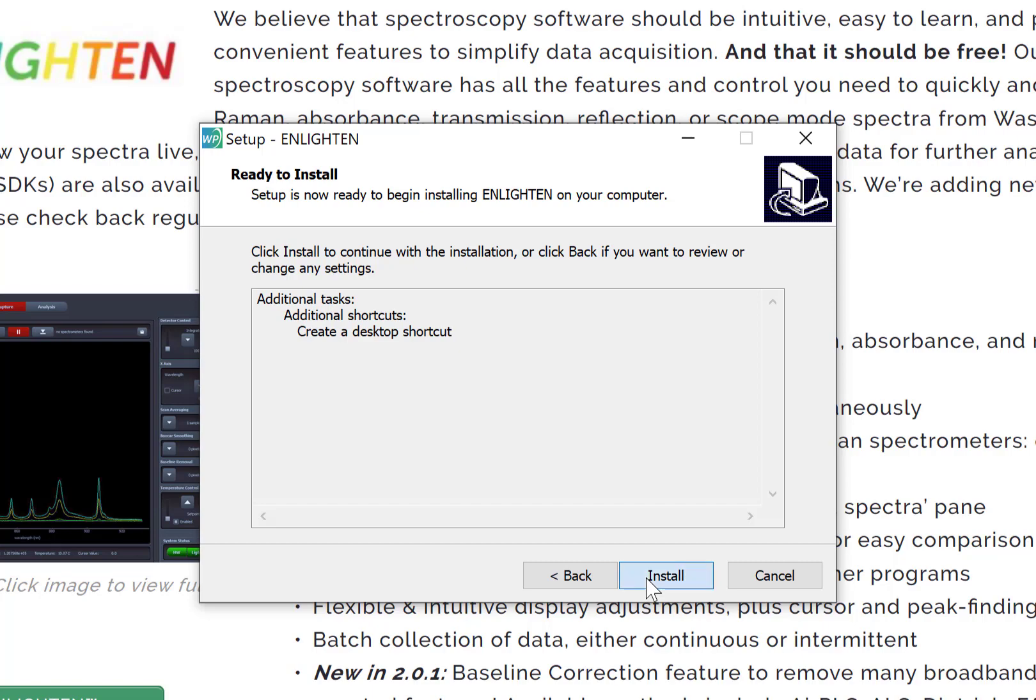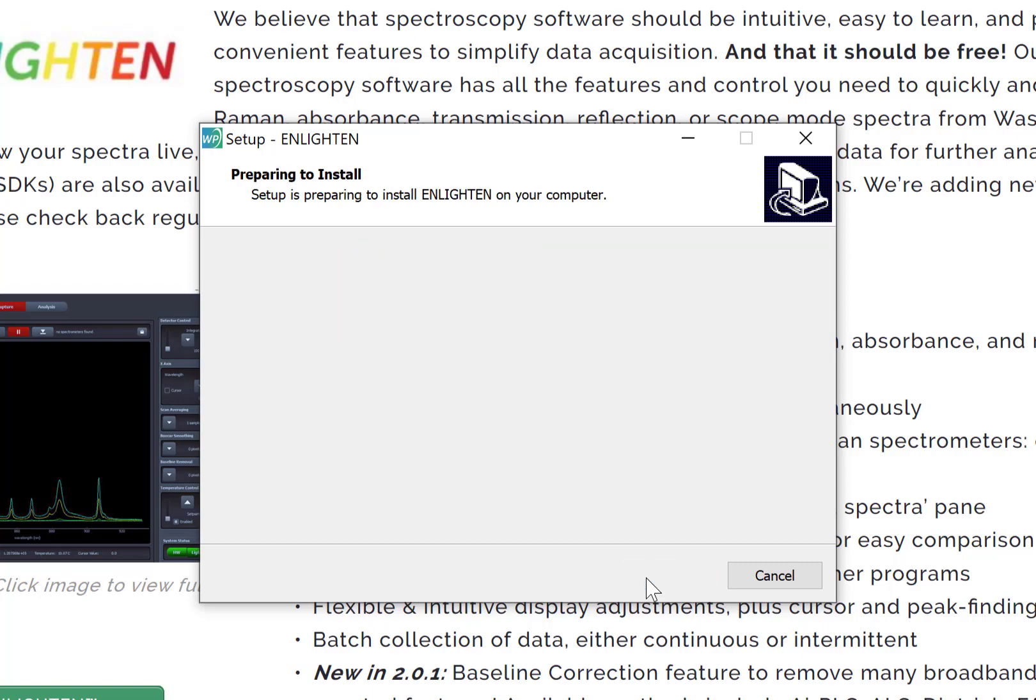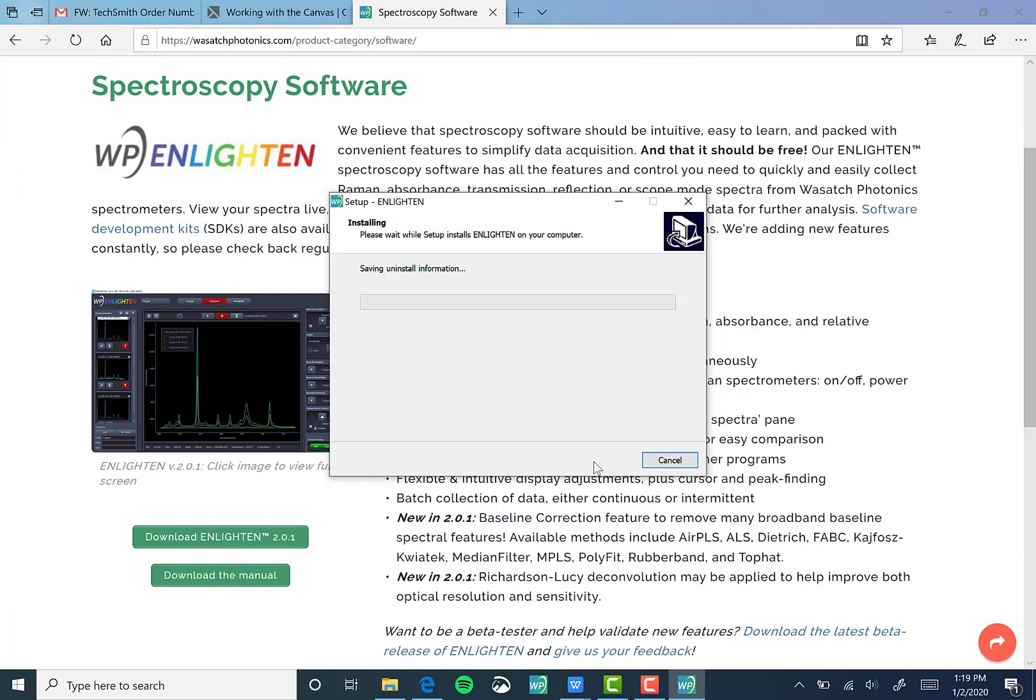After clicking Install, a progress bar will appear to let you know how much longer you have to wait until you can jump into Enlighten.